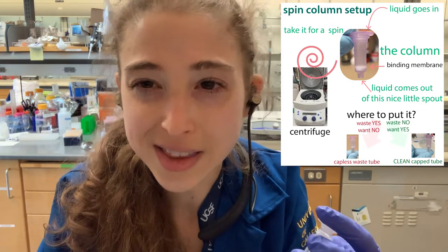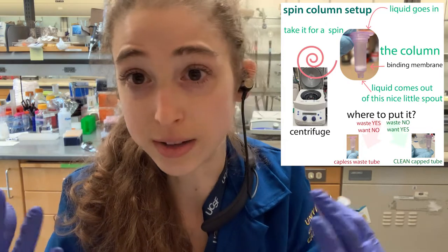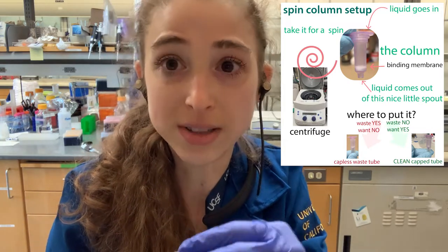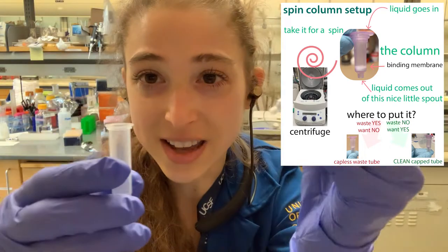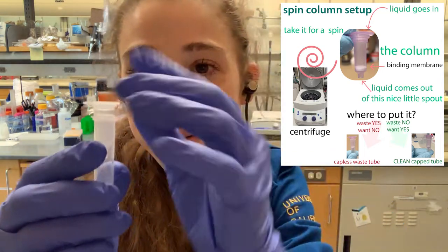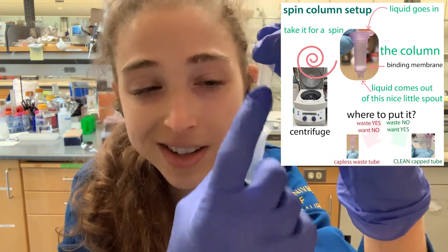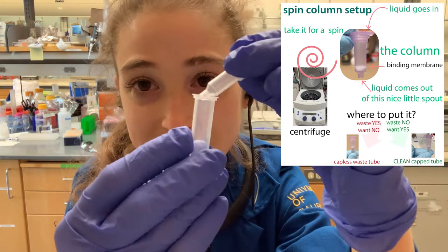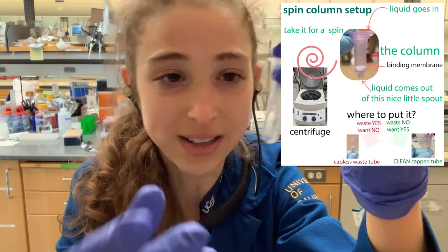It's not just the biological contaminants we're trying to get rid of — in the wash steps you have ethanol, isopropanol, and various things you don't want in your final solution. If liquid is dripping and getting on the edge of the collection tube, then you take your spin column and bang it back in, the DNA or RNA that's clean inside is now going to be exposed to that unwanted stuff.